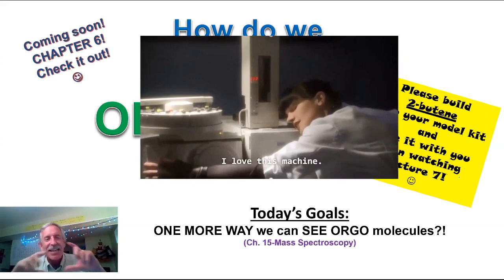This machine is awesome. MassSpec is one of my favorite instruments for two reasons. One is that we have access to it in our actual chemistry labs, and therefore it's a unique piece of instrumentation that very few undergrads get to play with. And we play with it a lot. So you will see it a lot throughout our labs, even remote labs. I'm going to introduce mass spectrometry in our remote labs a lot, just so that you get a handle on it.